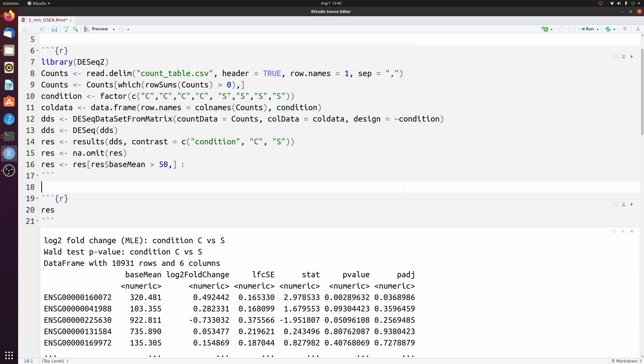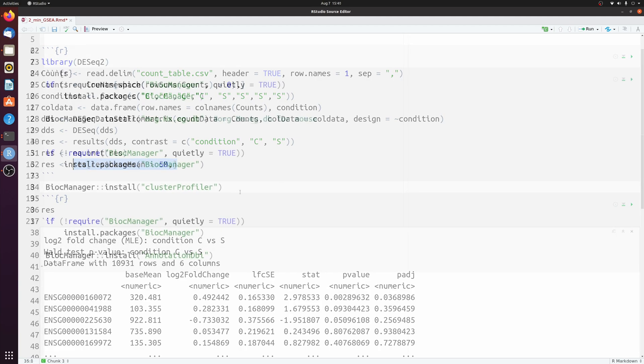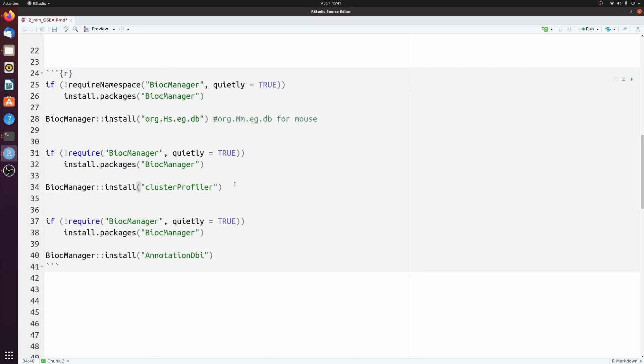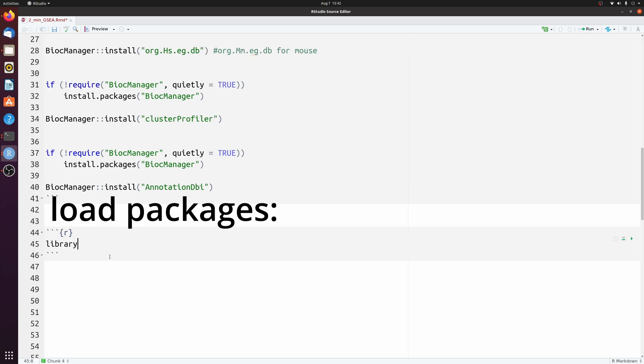The only filtering I did was on the base expression level. So we're going to be using a package called ClusterProfiler, but you'll also need to install the database depending on where your samples are. And we also need to install Annotation DBI.